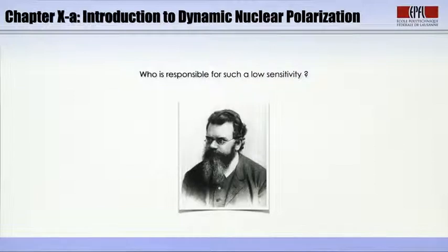So who is responsible for such a low sensitivity? On the picture here you can see Boltzmann, and we're going to explain now why the low sensitivity of NMR is mainly due to the Boltzmann law.